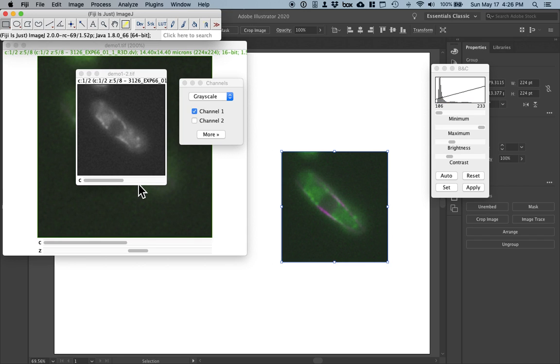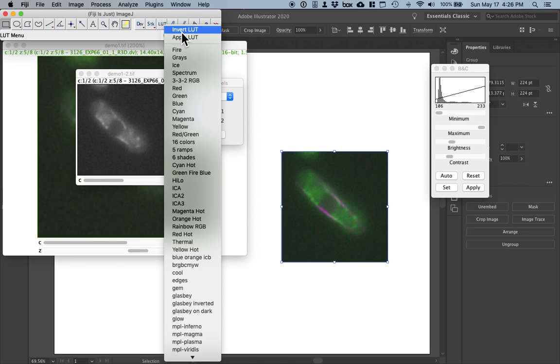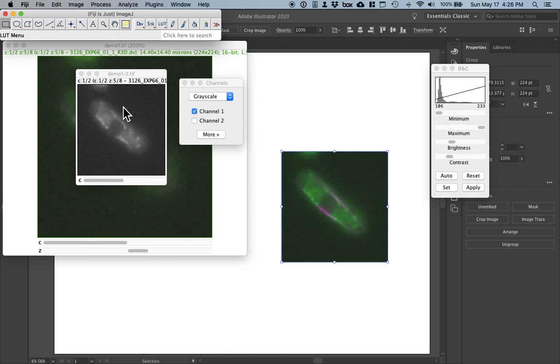And if you go to grayscale, you see the same thing. Oh, it's very angry with me. Just like that. And this is going to be the most useful because for images, when we're showing single channel images, by and large, we almost always want to show the grayscale or the inverted grayscale, which you can do up here by inverting the LUT. But let's just, for simplicity, do it this way.